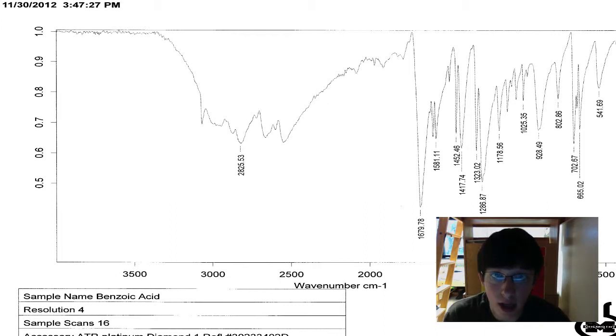Impurities can also mess with IR data. This is why we recrystallize. By doing this, we can remove soluble and insoluble impurities. Also, bear in mind that IR will only give you a general structural picture of the molecule. It can't give you an extremely precise diagram. It's hard to know. For that, you need NMR.